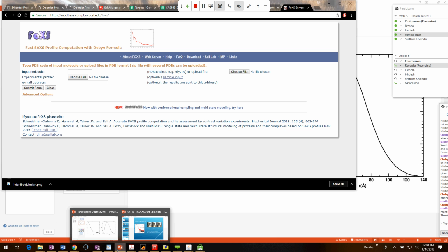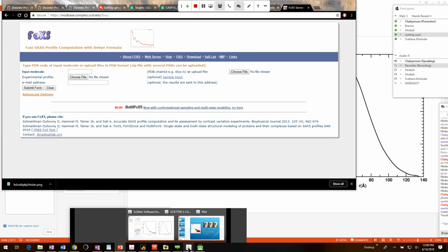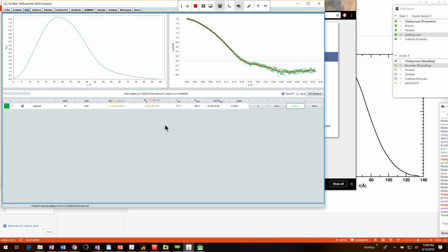My other question was about using Primus versus Scatter to generate the out file. Was there a reason why you use Primus? I haven't been able to get Scatter to give me an out file that I like. It might be that I don't have the latest version. The other reason is that it's gotten much better. Rob's made a humongous improvement in his P(r) calculator. In the past, it didn't work as well, but I'm getting more and more confident with it.